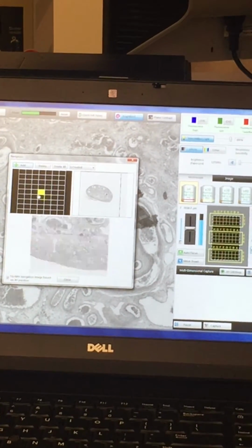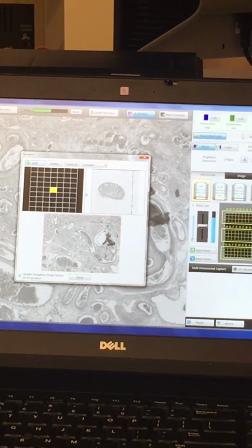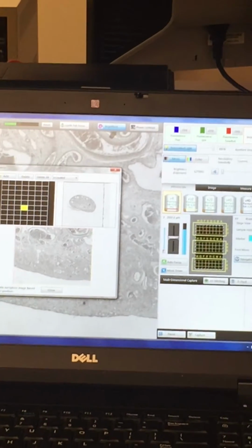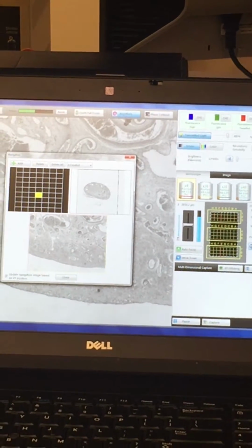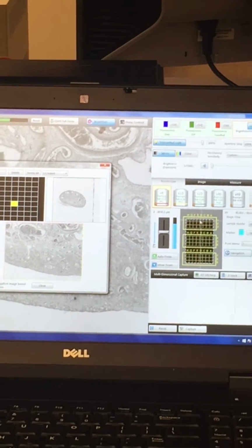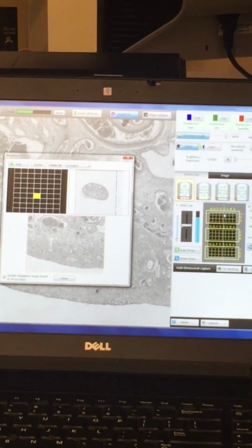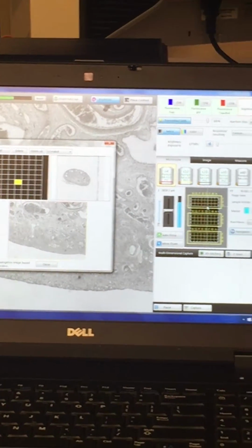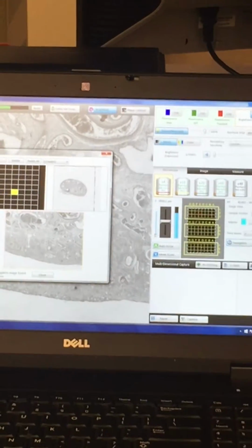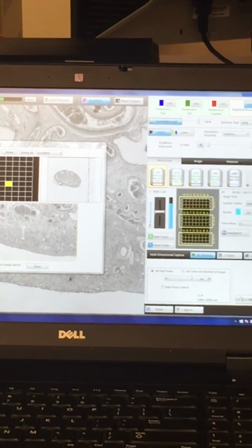Okay. So if you can imagine that this grid right here is overlaid onto this image, depending on which actual square my mouse is on, if I click there, that's where the field of view is going to move to. So you're actually going to use this to stitch together your slide. If you're doing the whole slide, you can see the limitations of the stage right here. So you could click right here and set this as point A, click here as point B, up top is C, at the bottom is D, and it'll do the whole thing for you at 4x, no problem. But if you're trying to get a specific sample down, this will be the best way to do it. So you click XY stitching, and then make sure set edge points is selected.